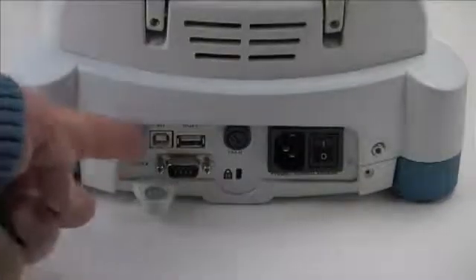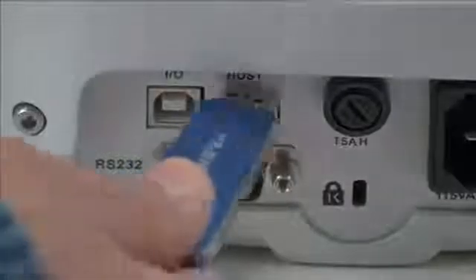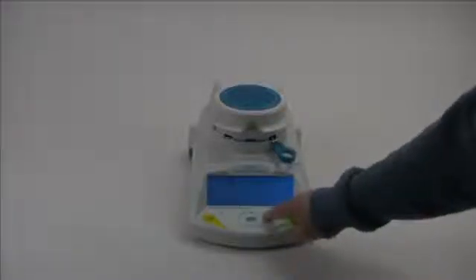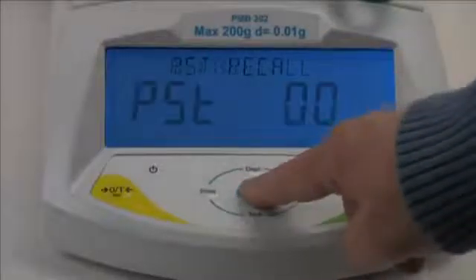Bi-directional RS-232 and USB ports allow you to connect to computers and printers easily. Adam's PMB also allows you to quickly store and recall test routines and results from many different products.